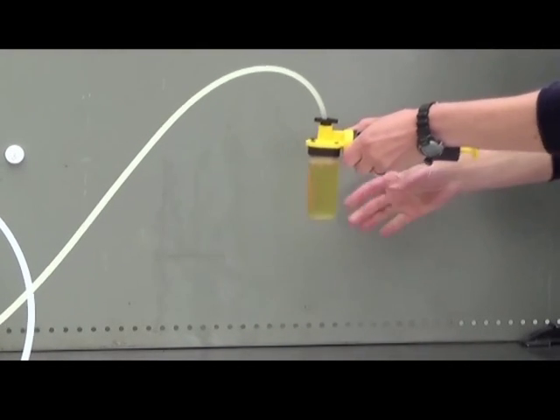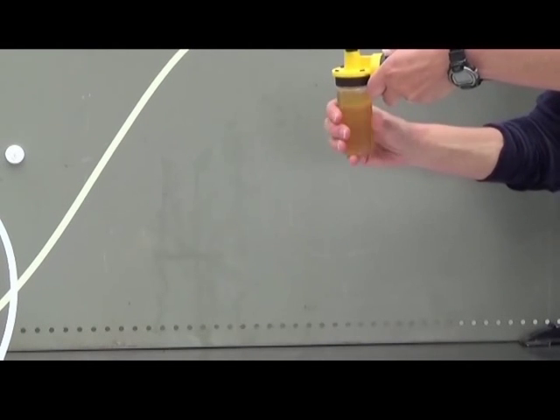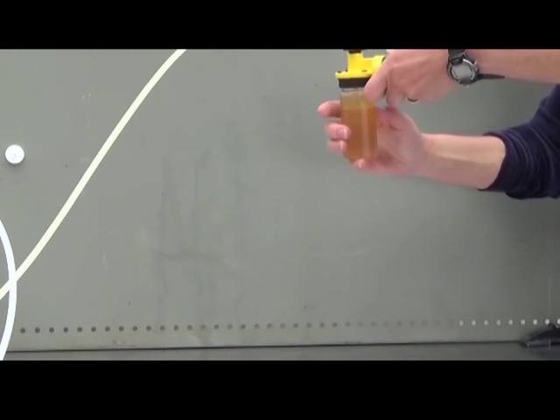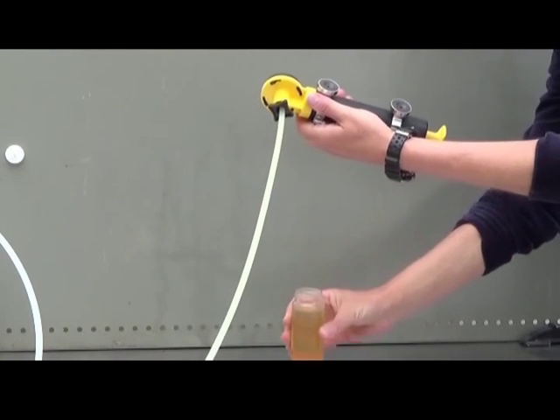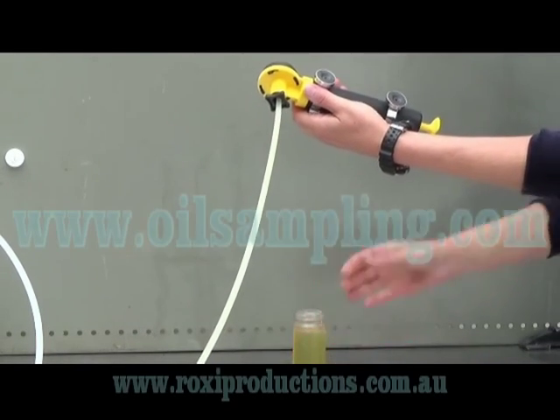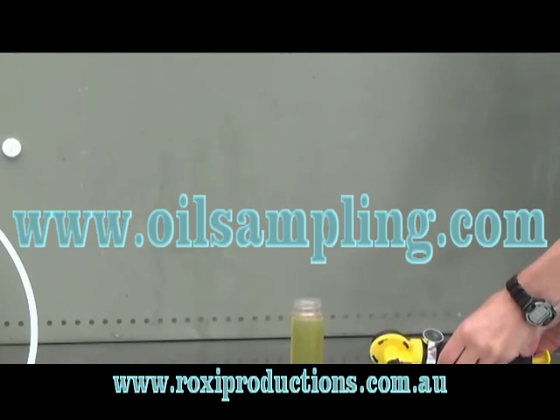Also make sure you keep an eye on the filling process and ease the vacuum by unscrewing the bottle once you have reached your desired level, or the bottle will continue to fill. All you need to do now is tap the bottle and you're ready to go.